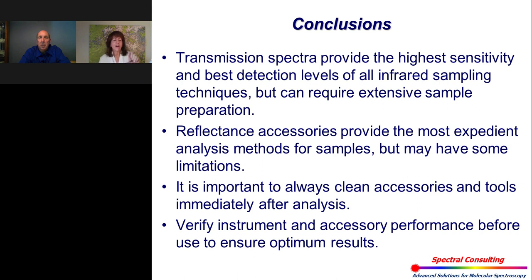So let's get started. Our first question is, does the ATR method of analysis have any disadvantages?